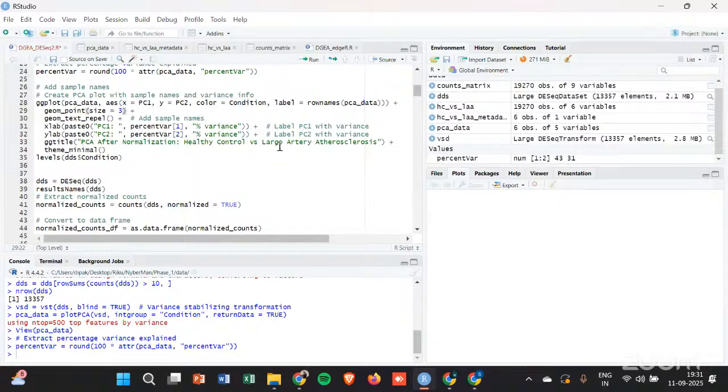And I've put theme_minimal here so that it does not use a lot of the advanced graphic libraries that a lot of you might not have. Usually every system has the minimal graphics libraries which are required. Some Linux systems might not even have these, and you might face issues. In that case, you just have to go ahead and install those graphic libraries, because this is necessary for ggplot. Or else you can also plot PCAs without ggplot, in base R, but that becomes way too difficult.